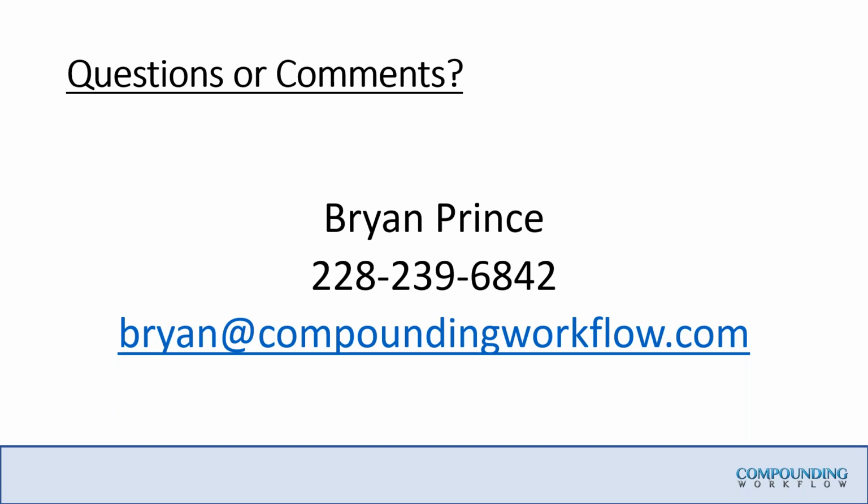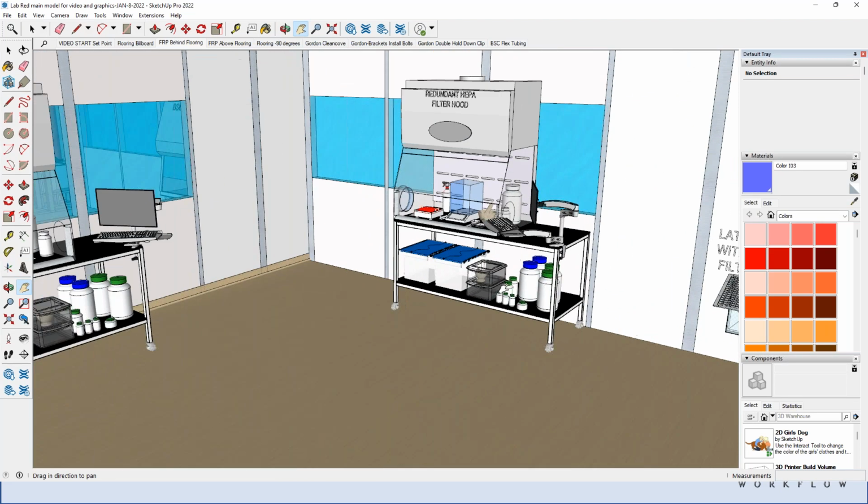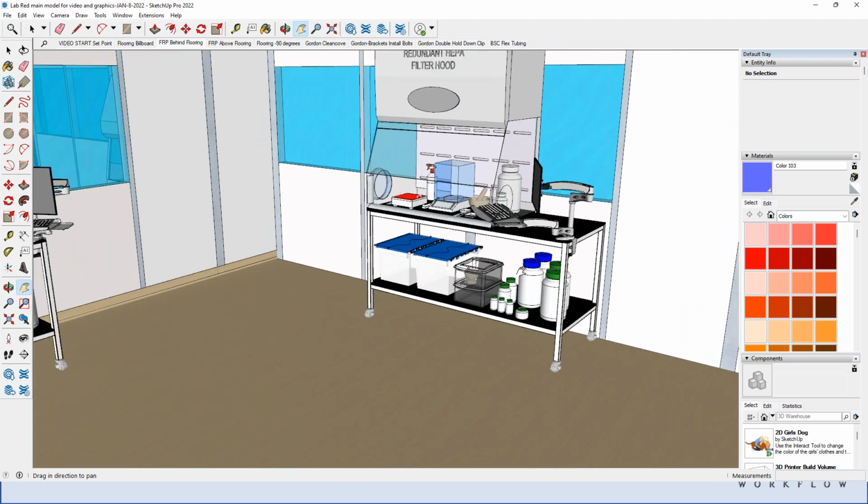Do you have a preference for casework, tables, or cabinets? I'm a huge fan of what's called the open shelving concept. I'm going to pull up this model one more time. Now, again, you have to DDCD: deactivate, decontaminate, clean, and disinfect. I would rather you do the open shelving concept.